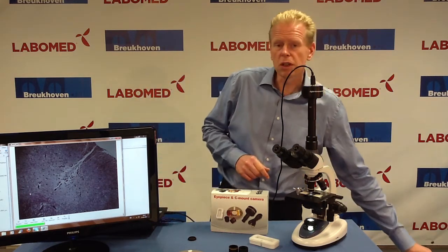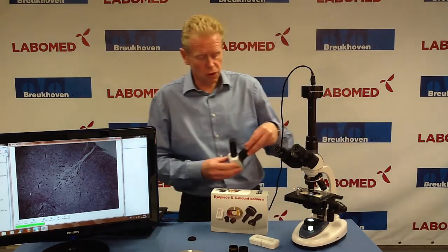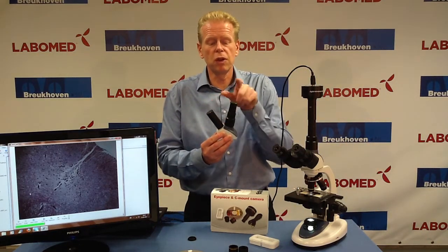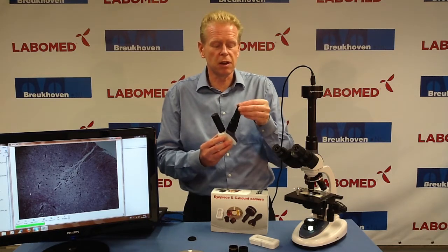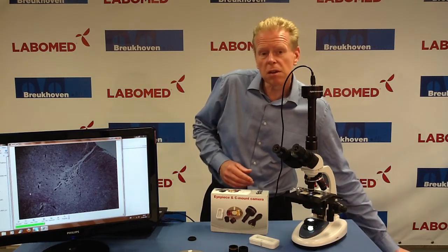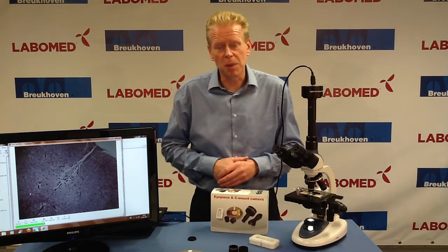In case you are using a student microscope, we also offer different hats so that students can look through while you have the extra tube available for the eyepiece camera. Altogether, a very nice range and I hope you enjoy working with it. Thank you very much.